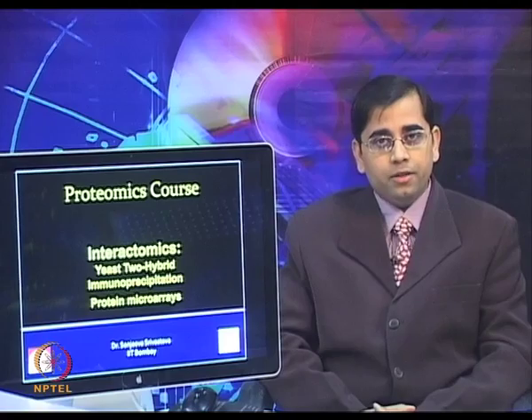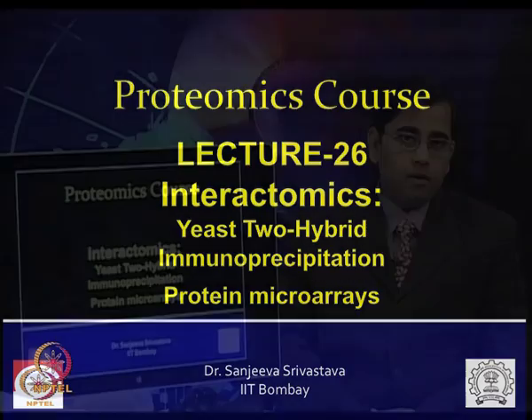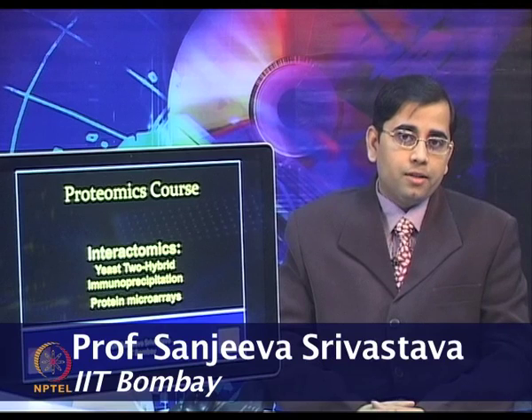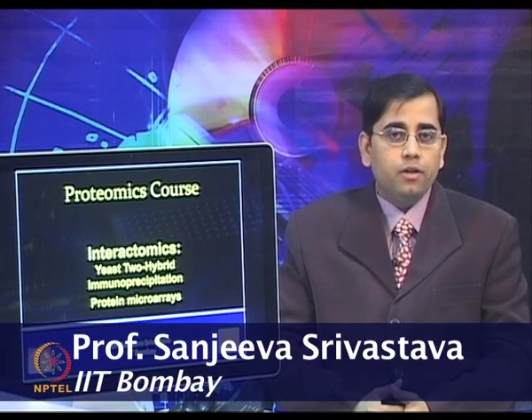Today we will talk about Interactomics, which is studying interactions of proteins and other biomolecules. We will discuss various types of techniques such as yeast two-hybrid, immunoprecipitation and protein microarrays.